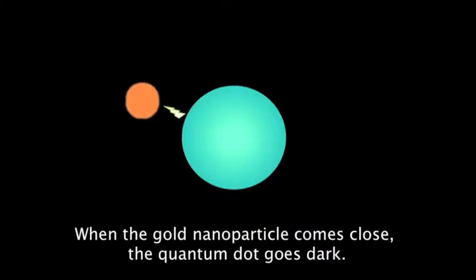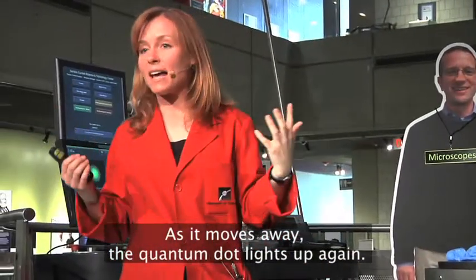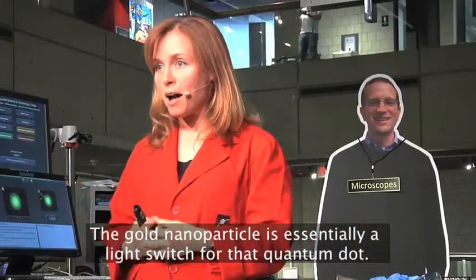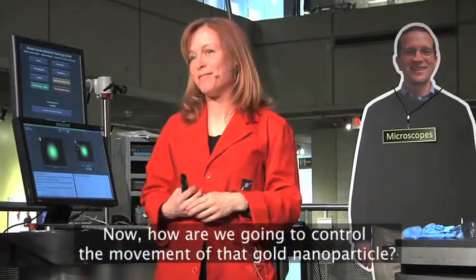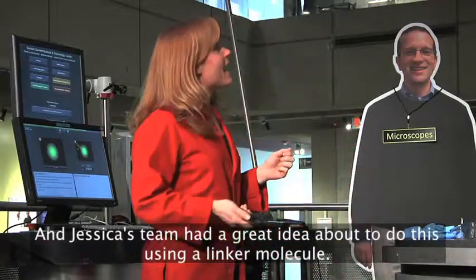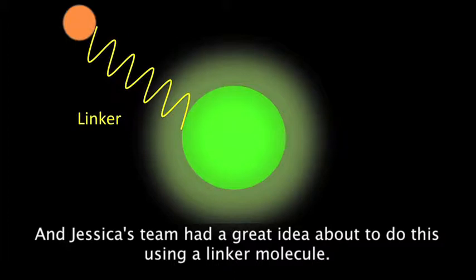The gold nanoparticle comes close, the quantum dot goes dark. As it moves away, the quantum dot lights up again. The gold nanoparticle is essentially a light switch for that quantum dot. Now, how are we going to control the movement of that gold nanoparticle? That's another engineering challenge we need to solve. And Jessica's team had a great idea about how to do this using a linker molecule.